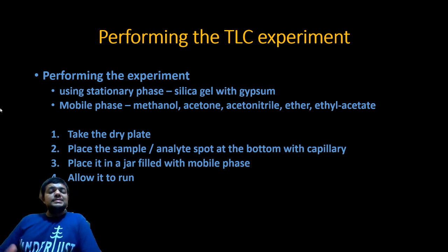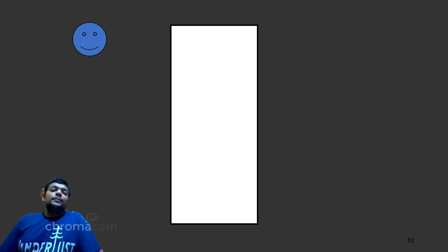Friends, science, nevertheless, is a very interesting subject, but animations and videos play a very important role. If I directly read these 4 lines, they are of no importance. But for these 4 lines, here is a very interesting video, or rather animation. First of all, we were supposed to take a plate. On this plate, we were supposed to put with the capillary 3 different spots or components.